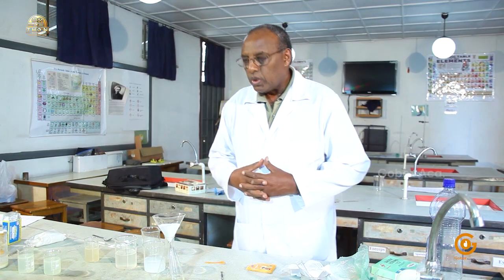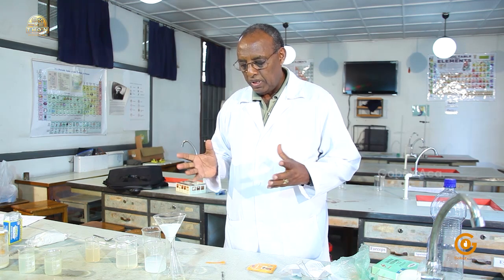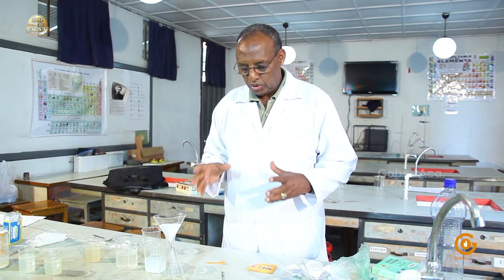To conclude today's experiment, what we have been trying to do is to see if solids dissolve in the most important solvent, water. Water is considered to be the universal solvent. Of course, we have to be careful not to think that it dissolves everything. That's not true.